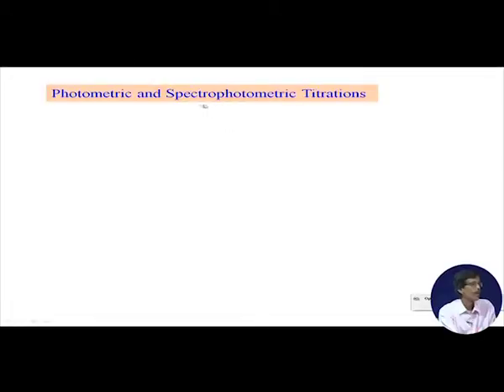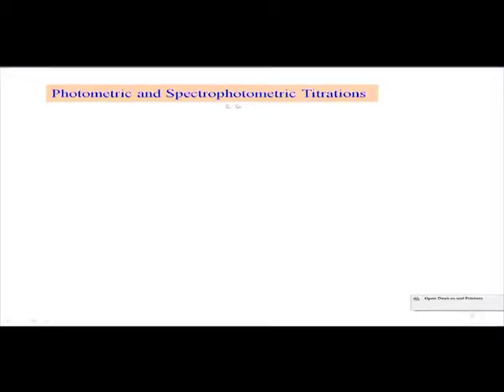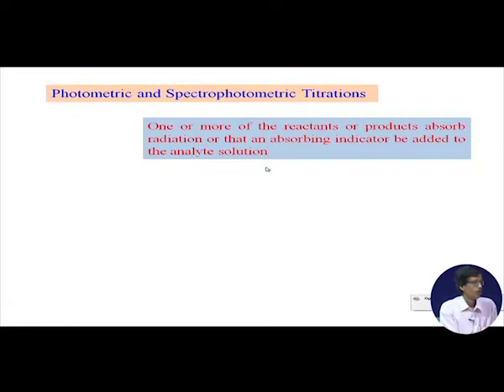That means individually you can measure palladium 2 plus and gold 3 plus, but we can also go for a titrimetric method, like a simple acid base titration, but taking the spectrophotometer itself for that titration. That means the cuvette of the spectrophotometer or photometer is utilized for the reagent, or the conical flask, where we can do the typical titrations by a simple burette or a micro burette also.